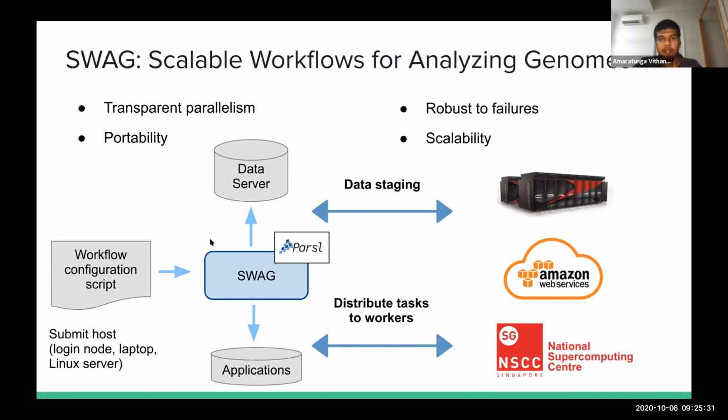You can create a workflow configuration with all the input files in BAM or FASTQ formats and mark them as either exomes or whole genome sequence and specify secondary analysis options. Once you submit the job, it will automatically provision the nodes and run the analysis that you have specified in the configuration script.